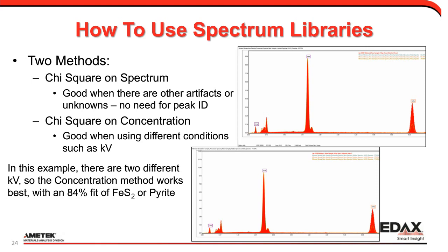If you use the spectrum match, the match by spectrum, it's just looking at your x-axis and your y-axis, so your peak energies and your intensities. Doesn't matter if you identified it, doesn't matter if you have identified it incorrectly, doesn't matter what your ID is. You can just match based strictly on the spectral fingerprint. Really, it's the intensities of each channel or eV bin in your spectrum.